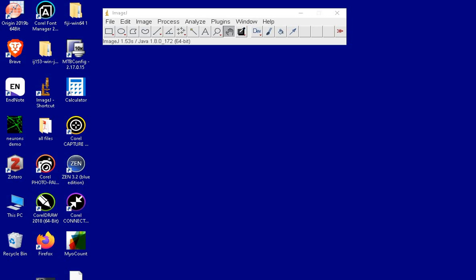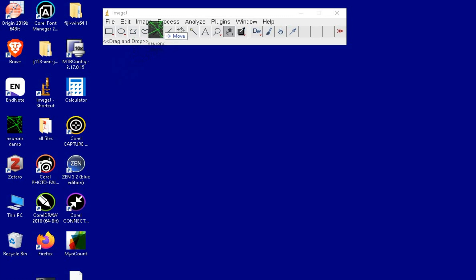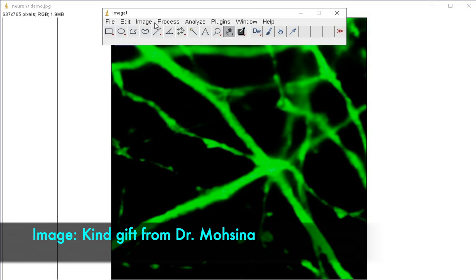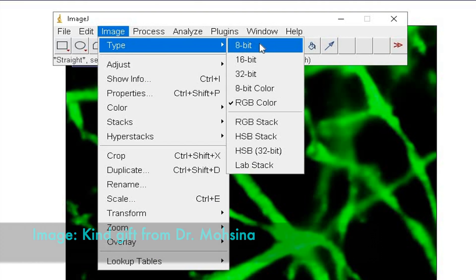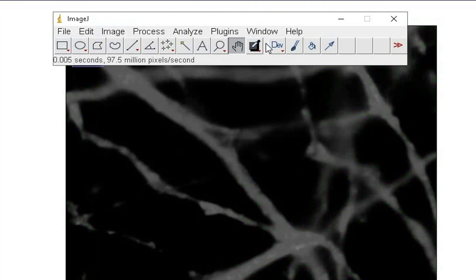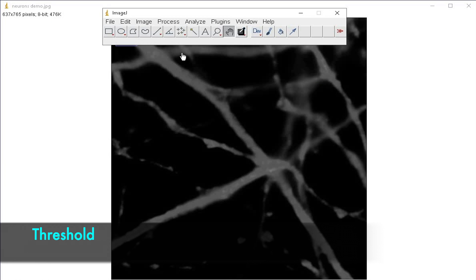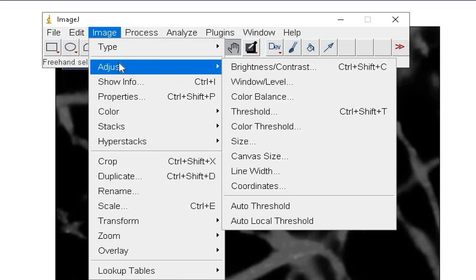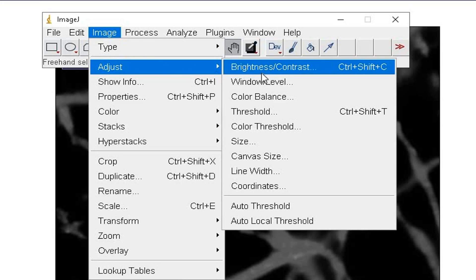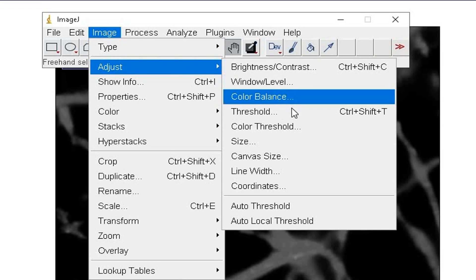To begin with, import the image to ImageJ by drag and drop method. The first step is to convert the image into an 8-bit image. Next, adjust the threshold by clicking on Image, Adjust, and Threshold.